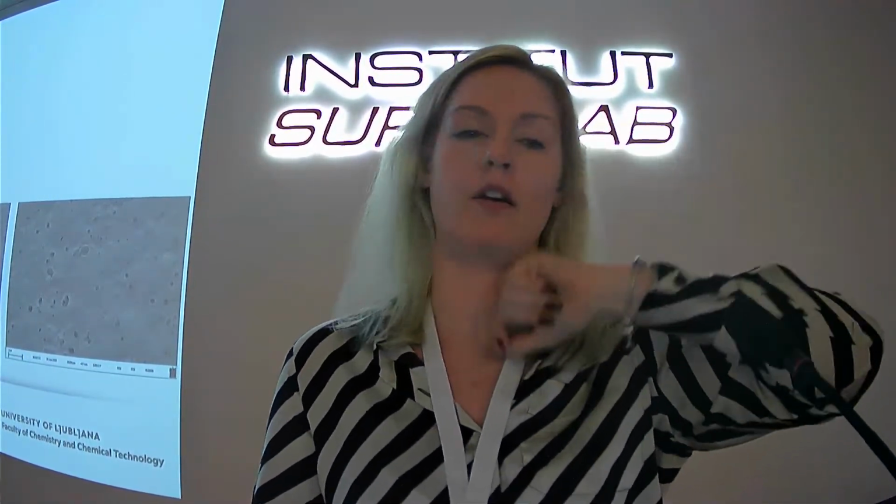In our case, we are usually using a scanning electron microscope. It's also much easier, because with the transmission electron microscope, the electrons need to go through the sample, so you actually need a very thin layer of the sample. So it's not really useful if you want to observe the morphology. The scanning electron microscope is a better choice, but you always need to coat the samples before.